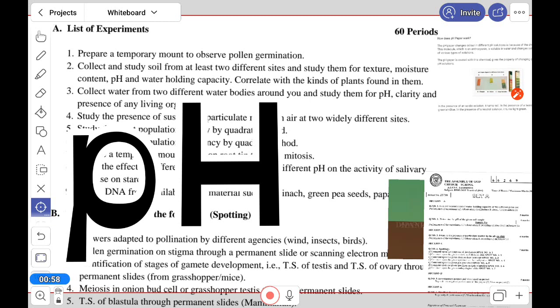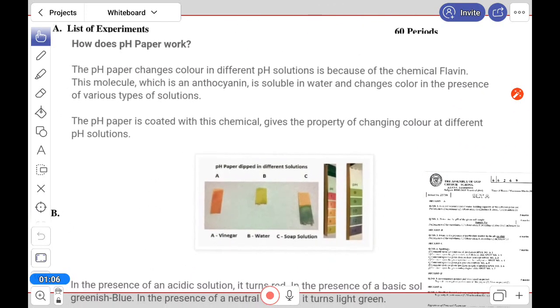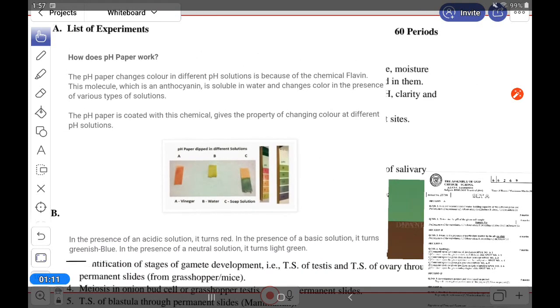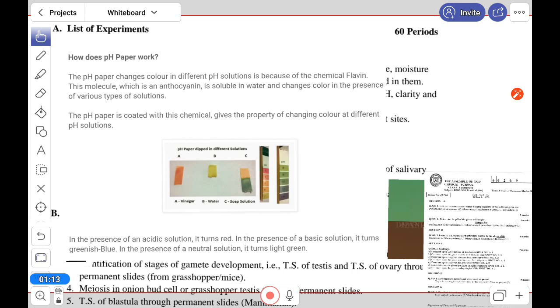Here we will use pH paper. Let me show you how this paper works. The pH paper changes color in different pH solutions. This type of paper strip has different color shades and the pH value ranges written over it. I think you have used this type of paper.